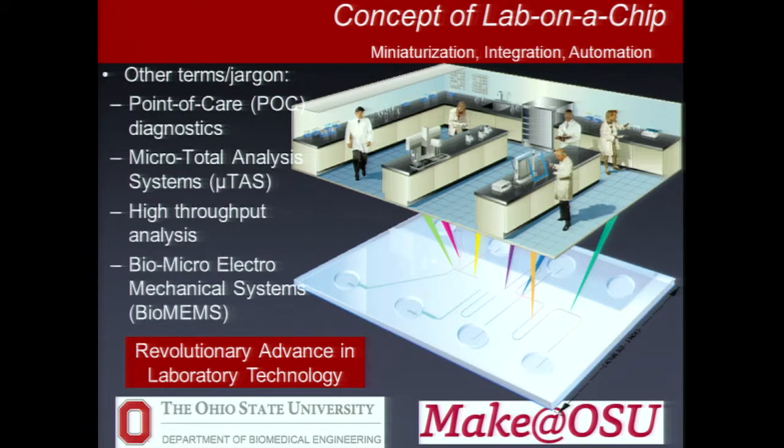And so some of these are for very specific reactions. These have been taken hold in industry. Also, just in terms of jargon, it helps to know where these fit. Point of care diagnostics is a concept. By shrinking this down, it becomes transportable. And so you can take it to where it needs to be for care. Micrototal analysis is the concept that you can take a raw sample, stick it into one of these systems, and come up with your answer on the final end. So you can stick blood in straight from a patient and get the result out.